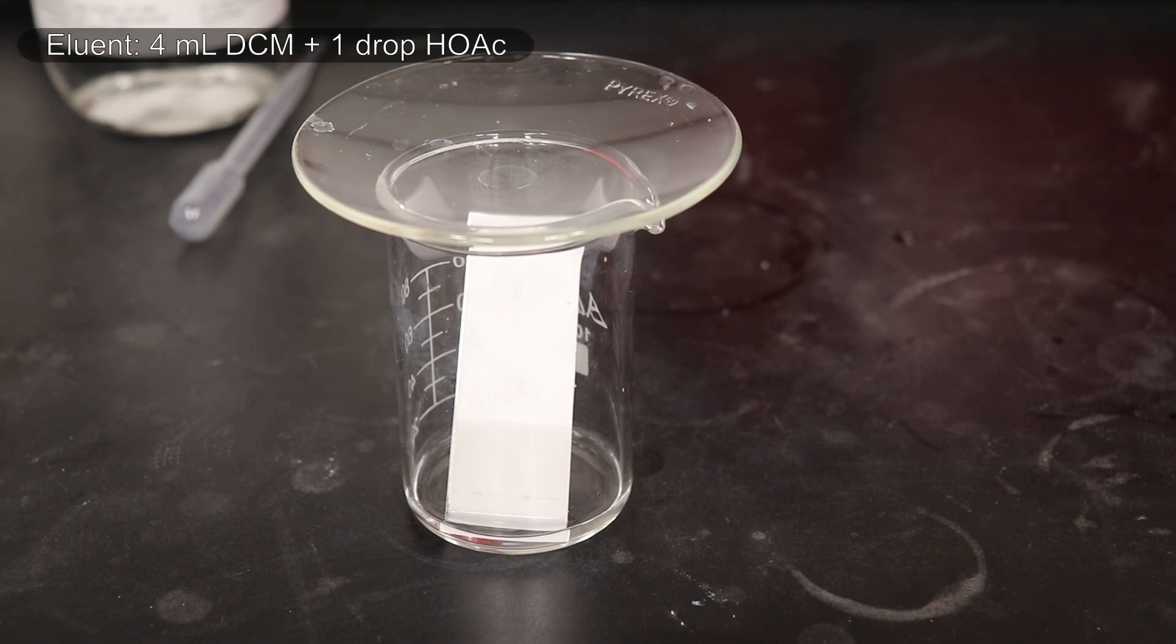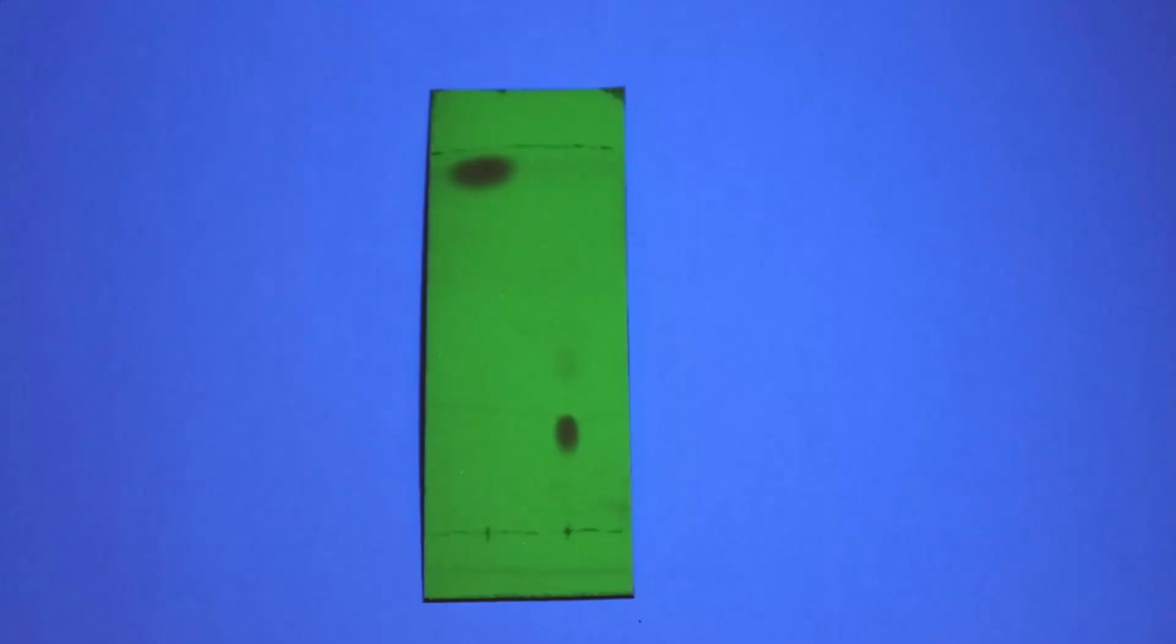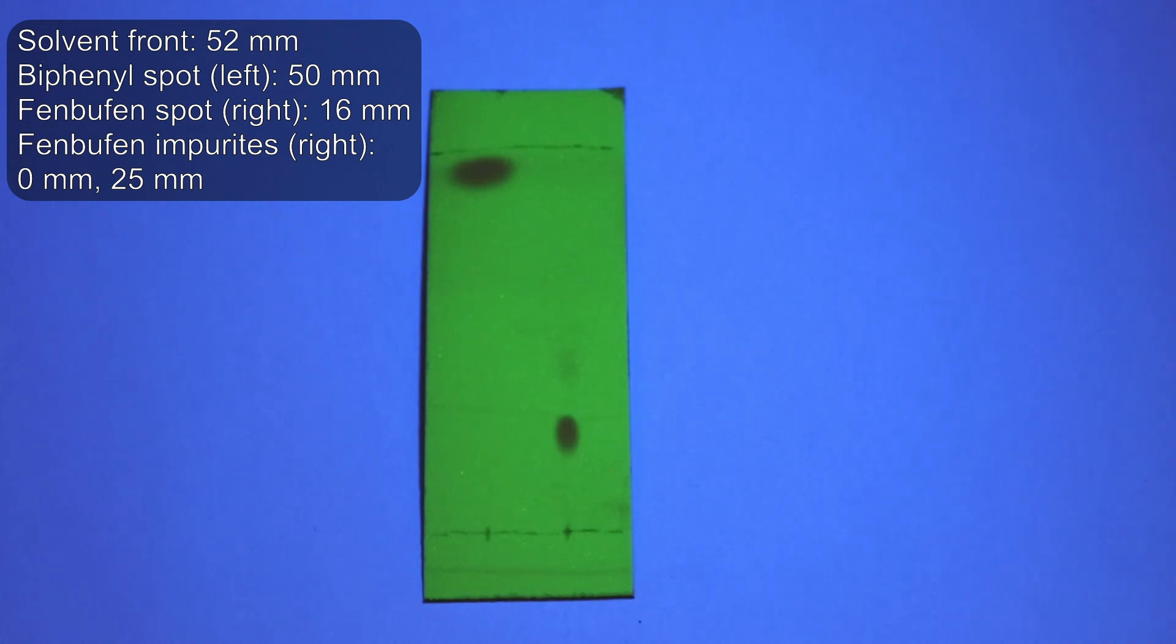So the next thing I did was run a TLC to try and see if I could find any impurities in the sample. As an eluent, I used DCM with a single drop of glacial acetic acid added. The left lane contains the starting biphenyl and the right lane contains the fenbufin, though unfortunately I did not have a sample of pure fenbufin to make a reference spot.